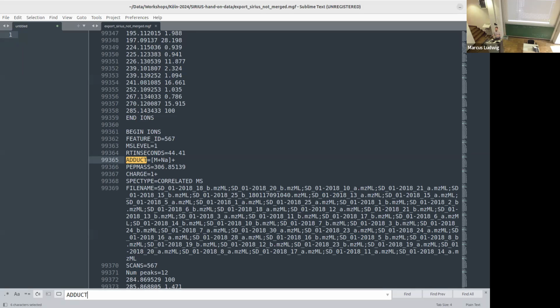The same also goes for mzML files. You can open it, it's just XML. You can open it and see what the isolation window is and what reasonable data is in there. Just before you wonder why something went wrong, it's always a good idea to do that. Yes, so far so good?